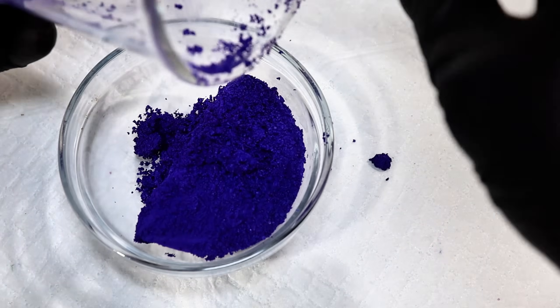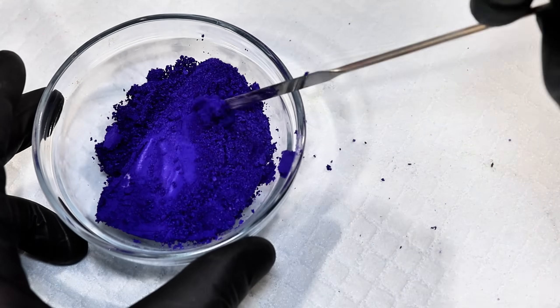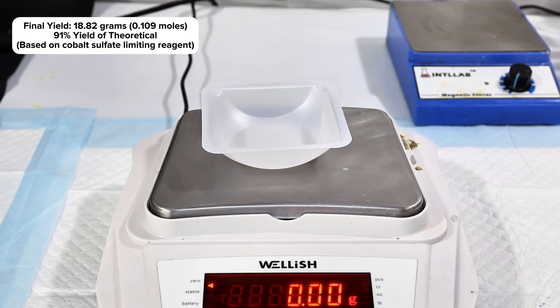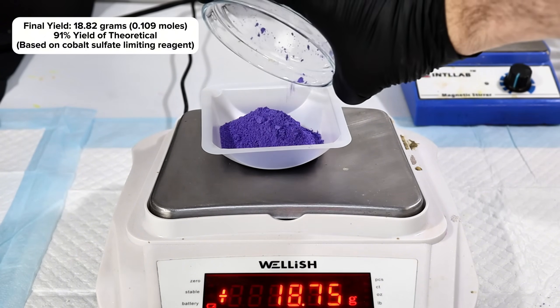This time I dried the powder overnight in my vacuum desiccator, and when I came back the next day, I found that the completely dry cobalt violet had lightened up noticeably and taken on a somewhat chalky consistency. I went ahead and weighed this for a final mass of 18.82 grams, which represents a 91% yield of the theoretical.